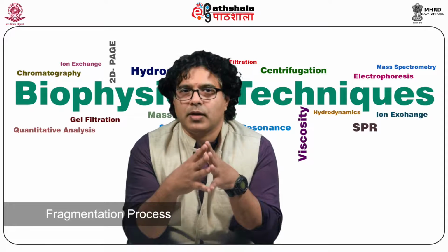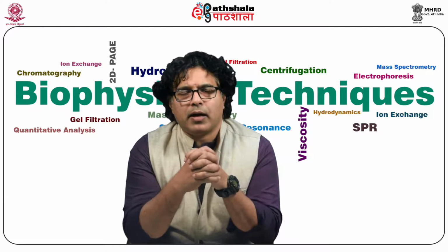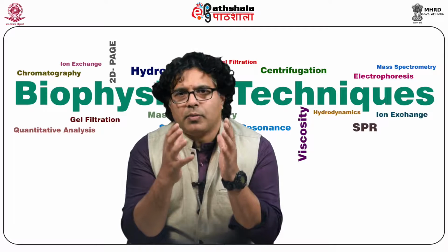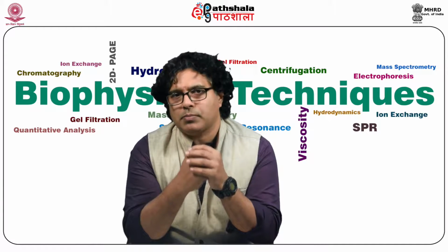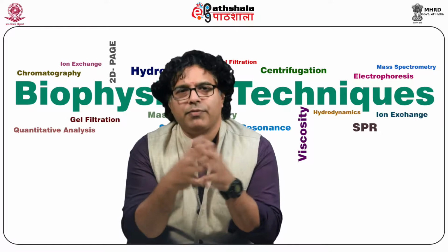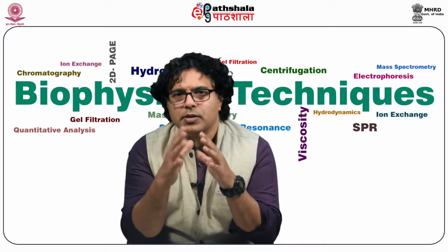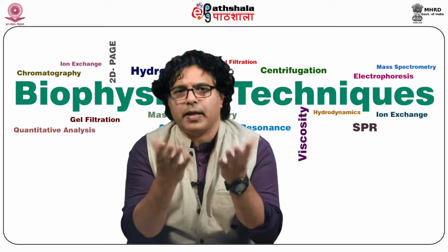Fragmentation process, in which the mechanism involved has been explained by Bowie's rules. Fragmentation happens in quadrupole 2, when the pseudo-molecular ions are colliding with neutral gas molecules, the weaker bonds are broken and the intermediates are formed. This is something which is very difficult to explain, but Bowie's rules conclude that there are some general rules which are happening in that.